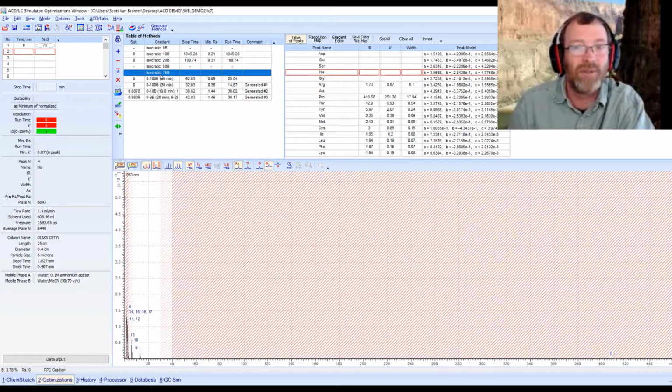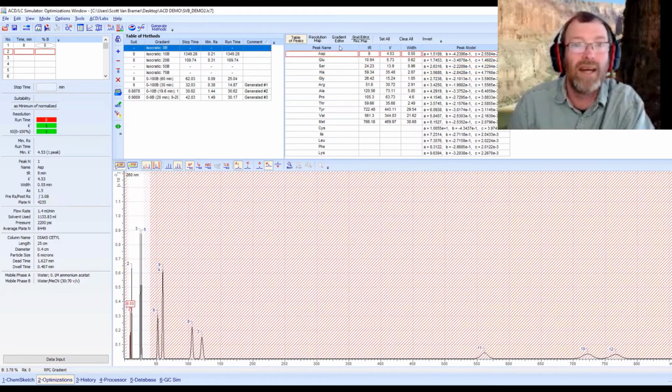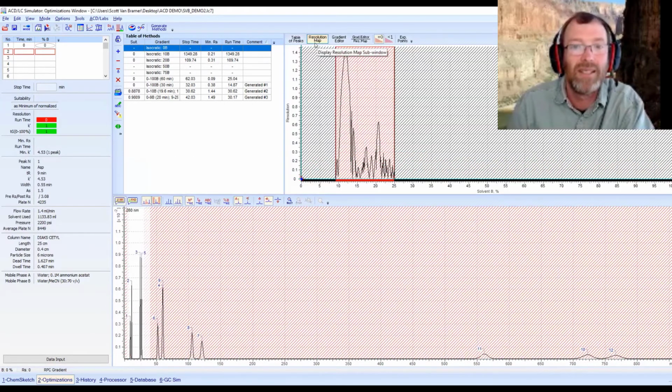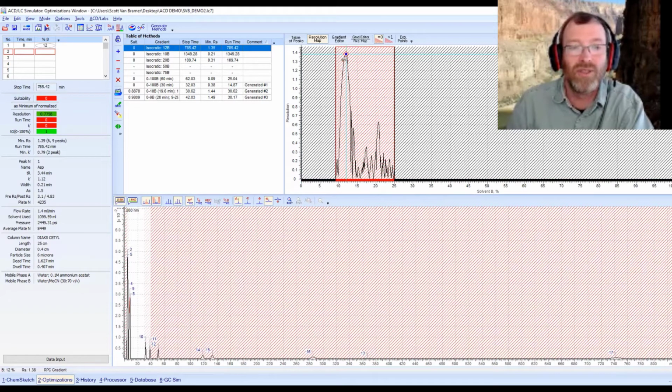And if we go up to 75%, it's even worse. So what you'll find here is there's really no options that work. And if we look at that resolution map, the software actually tells you that right up front, right? So it does not matter what the percent organic phase is. There is no sort of good solution. And even here, that's sort of the best solutions right there. There's a number of components where the runtime, it's just crazy, way too long.